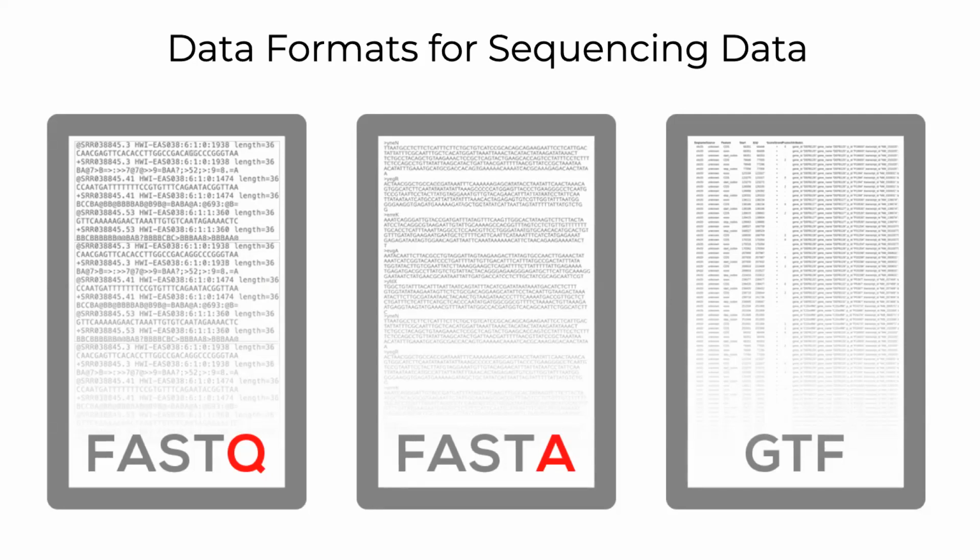Today's topic really is to focus on viral sequencing and explain how the sequencing technology works conceptually, what information does it contain that we can analyze. So let's take a look.